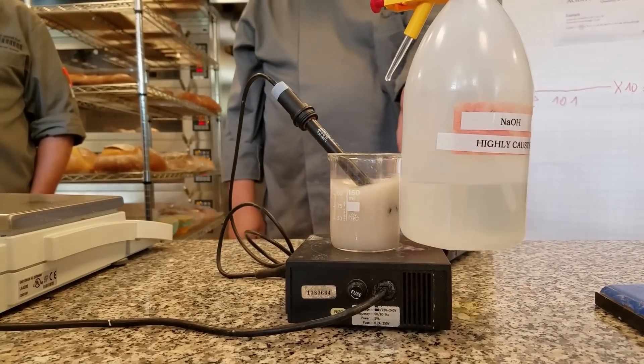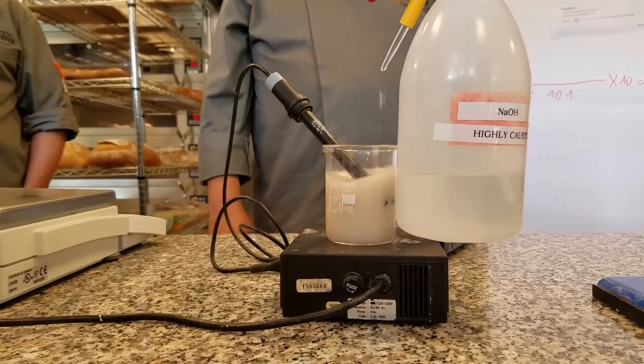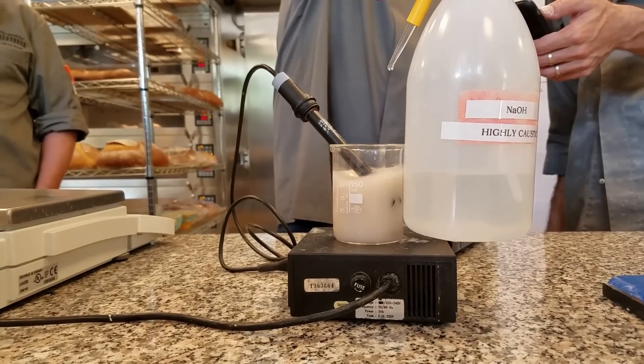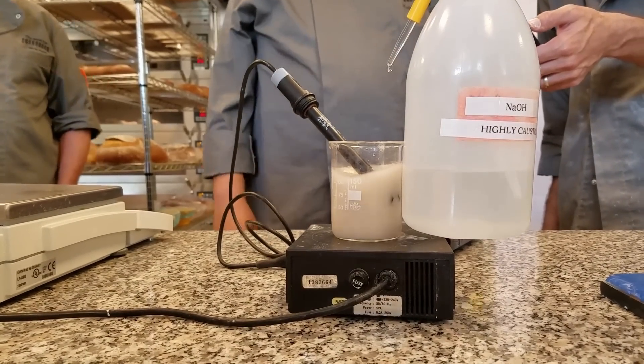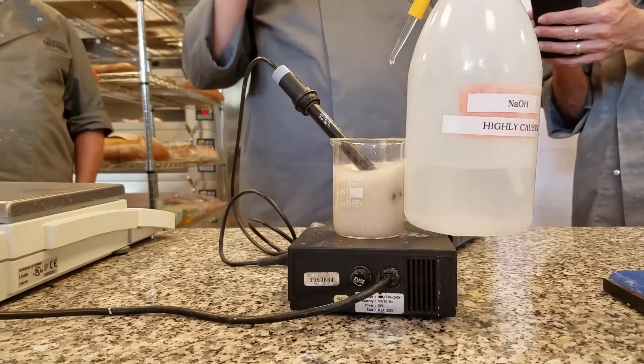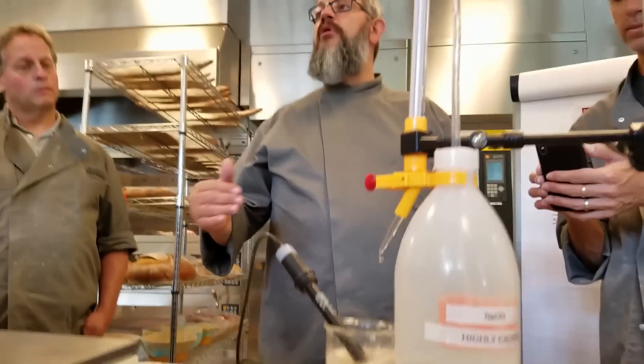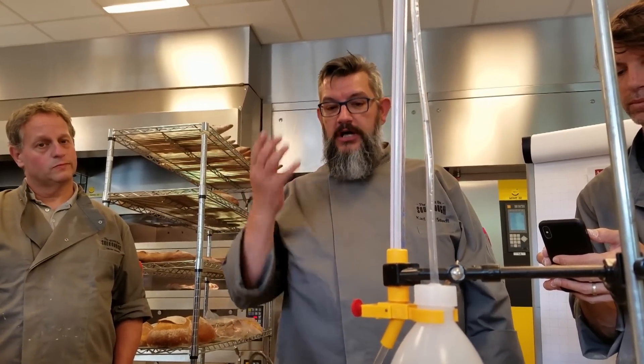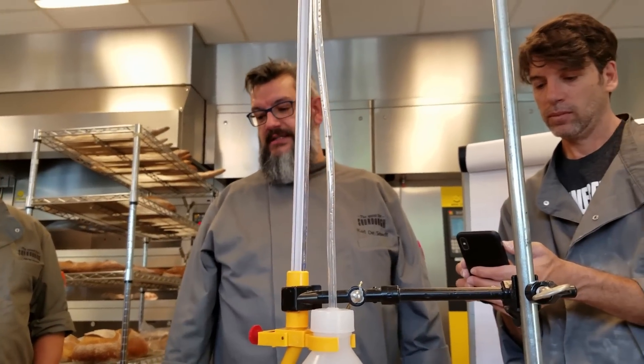So if you keep an eye on the pH meter now, it starts going up. Are you counting drops? No, we will measure here afterwards. And we stop at 8.4 because above 8.4, you can't measure them anyhow. So it's what you measure at 8.4. That's the total titratable acidity.